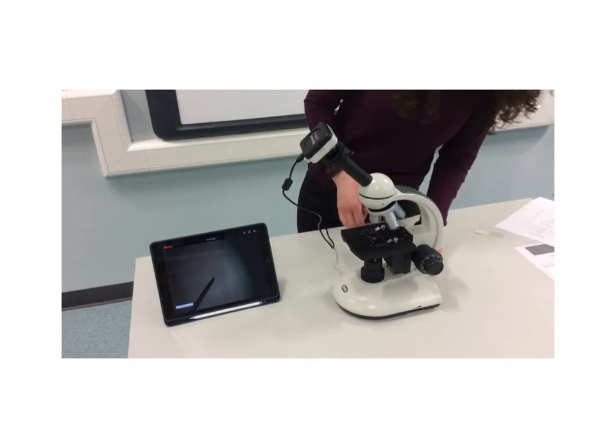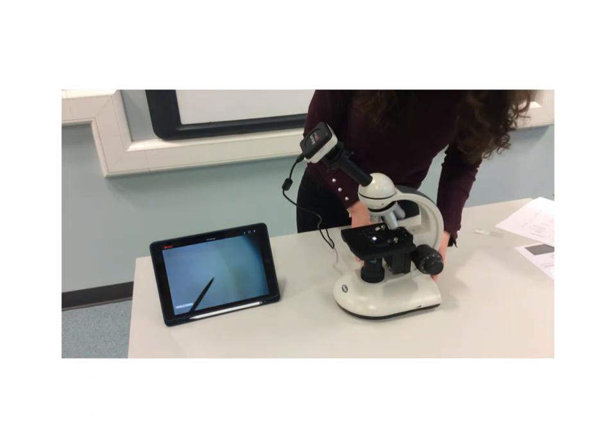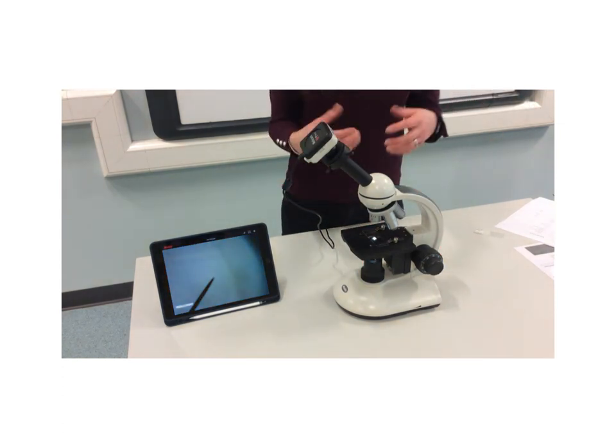And at the minute my light is off, so I'll turn it on and you can see if you can see a difference on the iPad. So did you see that? I'll turn the light off again and I'll turn it on again. So you can see that brightening up. And it's really important to see an image at all.